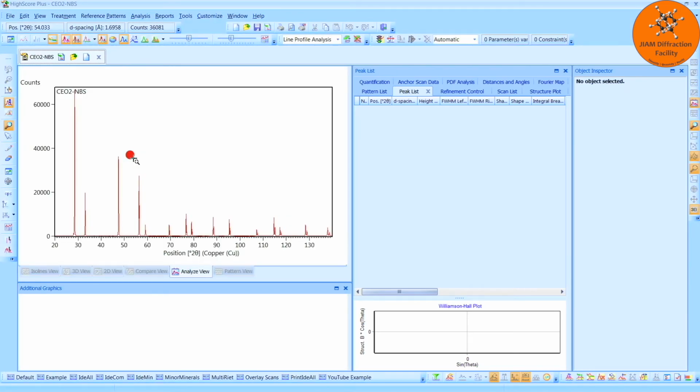and there we see it. Now, just to make it abundantly clear, you would not use this diffraction pattern in order to analyze your own samples. I am only using this pattern because I am also analyzing data provided by Panalytical. If you want to analyze your own samples, you would need to get some sort of line profile standard, and those are available at NIST. They are cerium oxide, lanthanum hexaboride, and there are others.